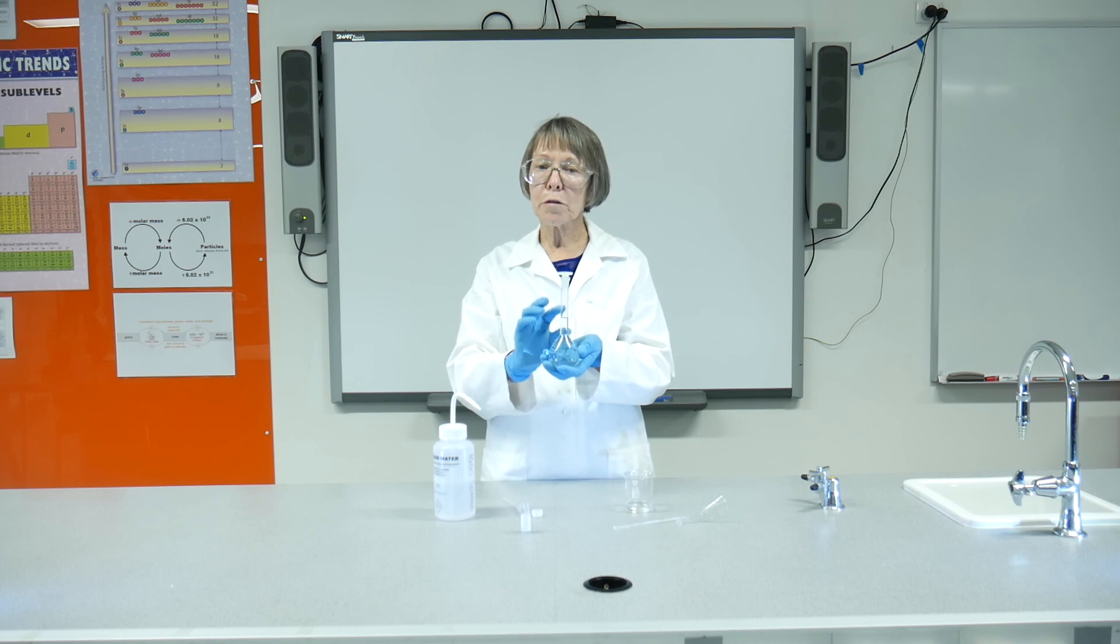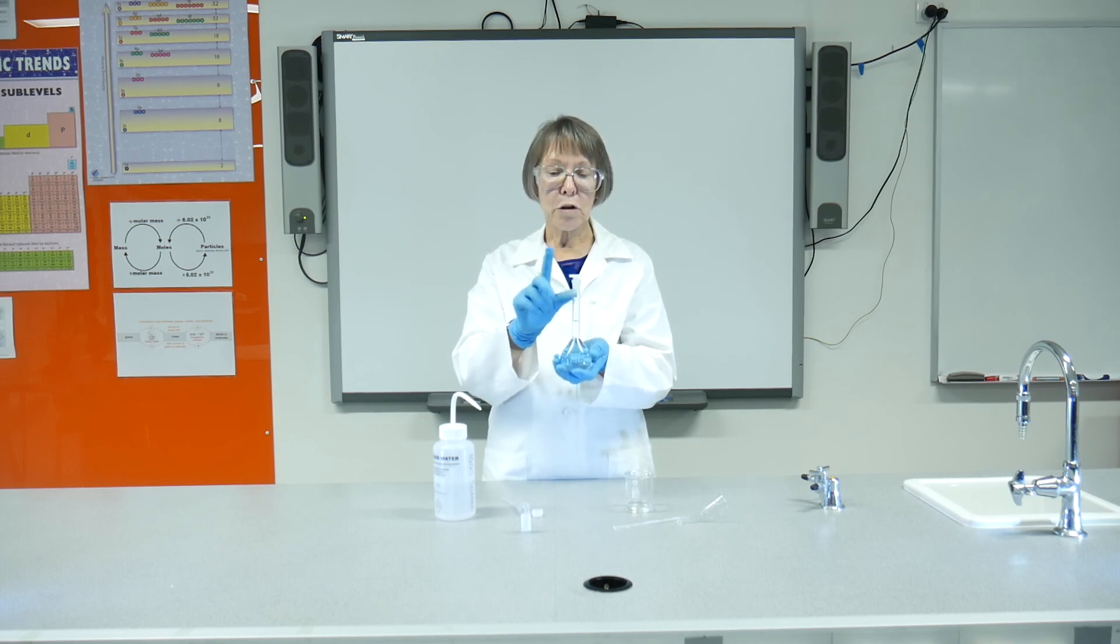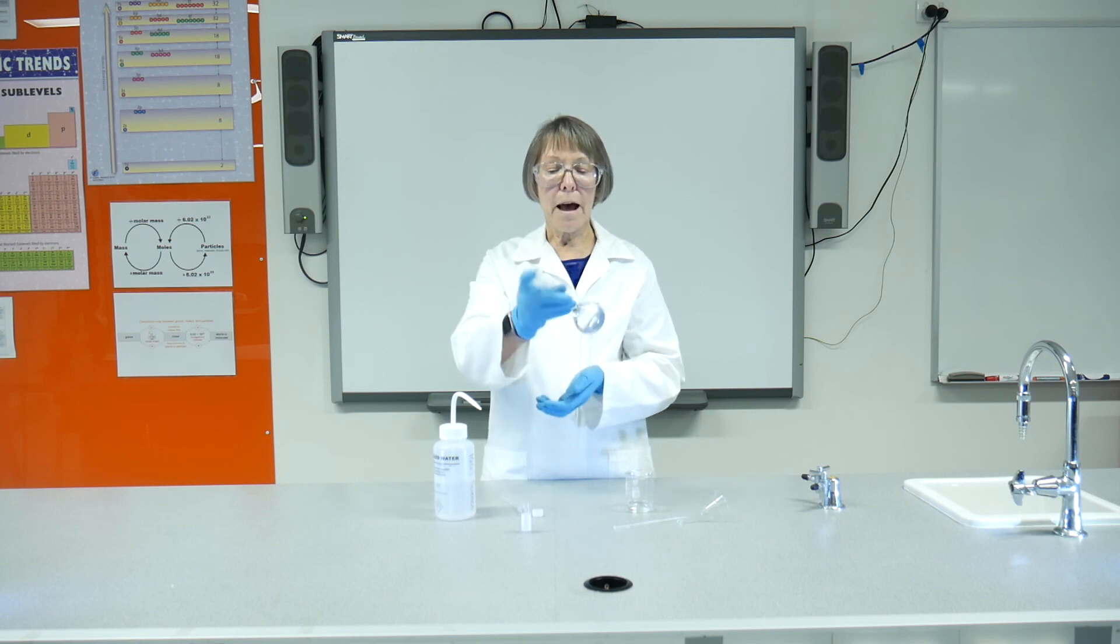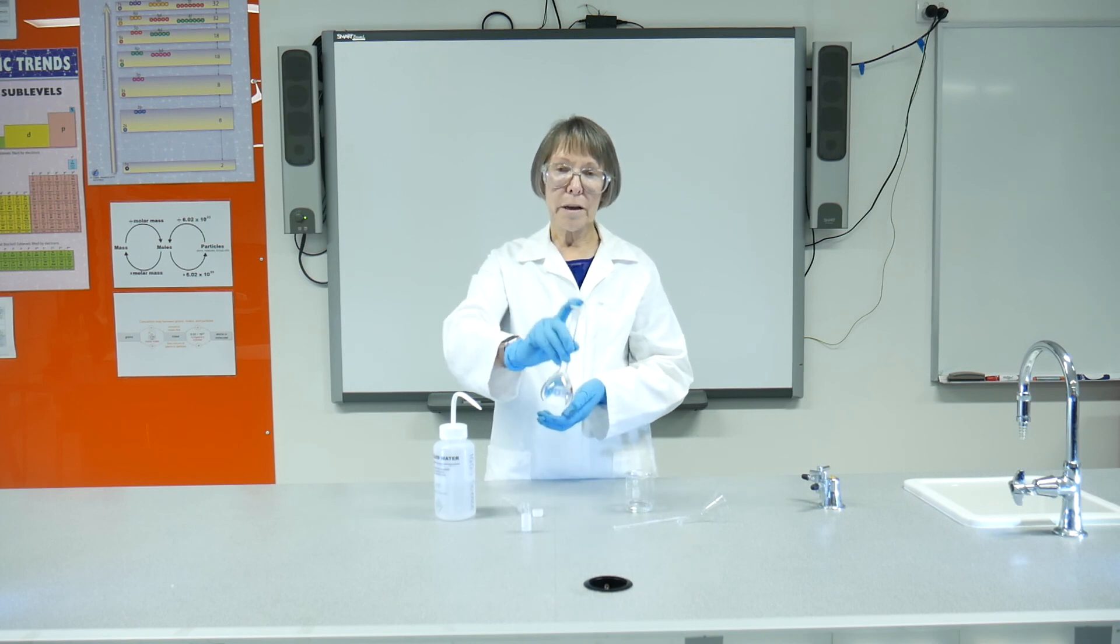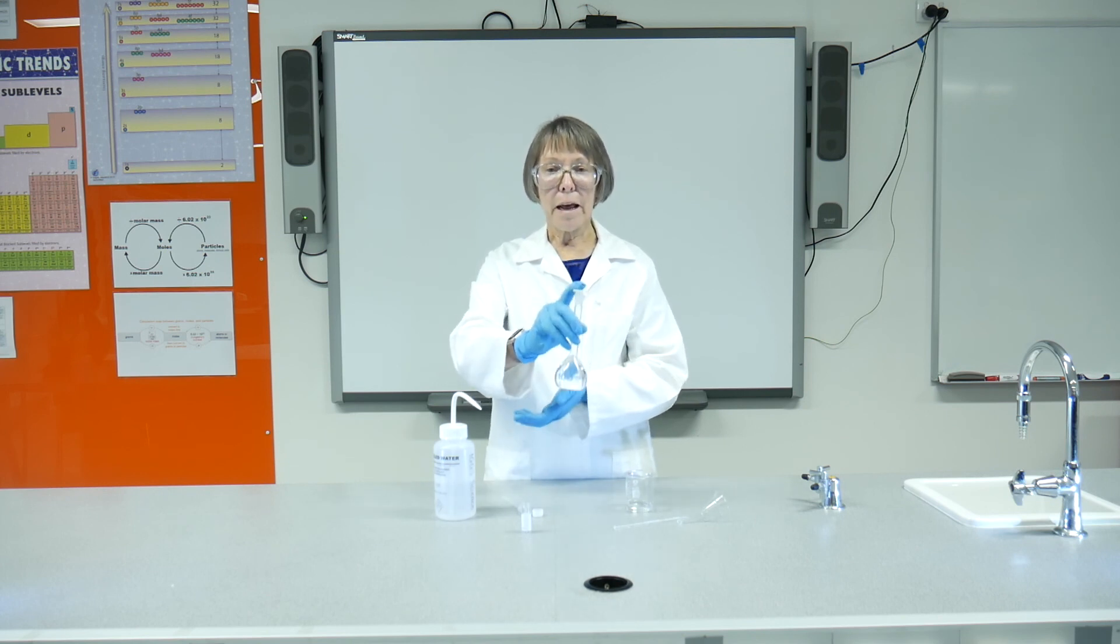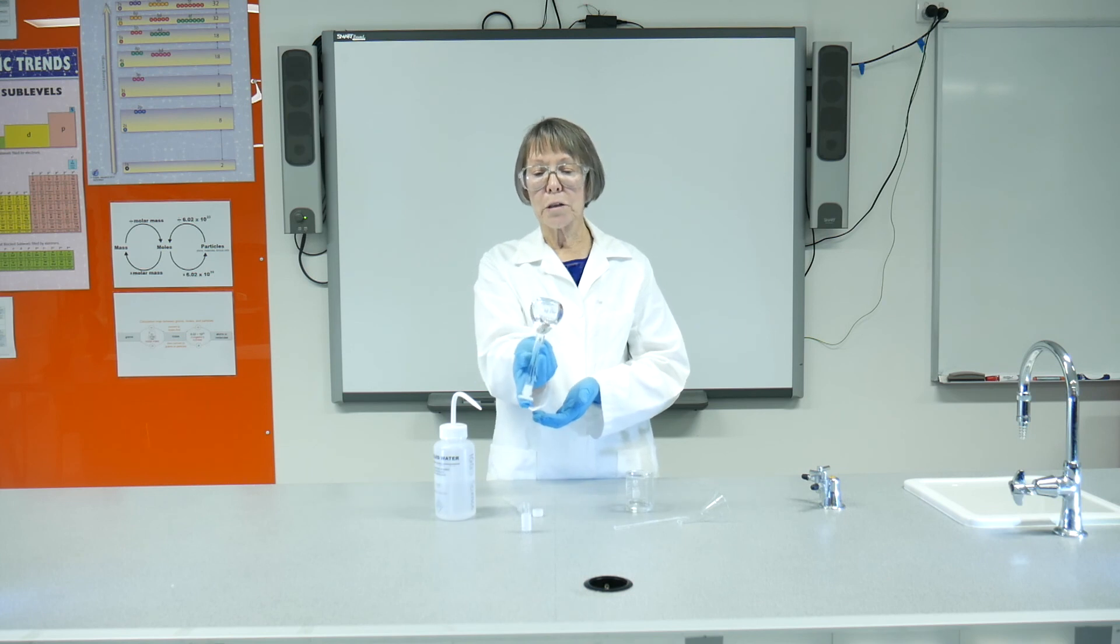Now that we've got the volume to the right level, place our stopper in, finger over the stopper to hold it in, and simply invert a number of times to make sure that we mix it thoroughly and have uniform concentration of the solution in there.